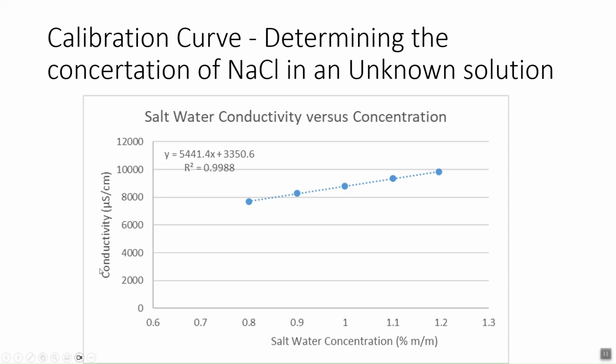So we can take the thing we can easily measure, conductivity. You just stick a probe down into the solution and you can measure its conductivity, and we relate it to the thing we want to know, the concentration by mass of salt in the solution, so that we can see if it's safe to inject in a person. And again, of course, this is not safe to put in a person because it's not sterilized or anything like that, but you get the general idea.